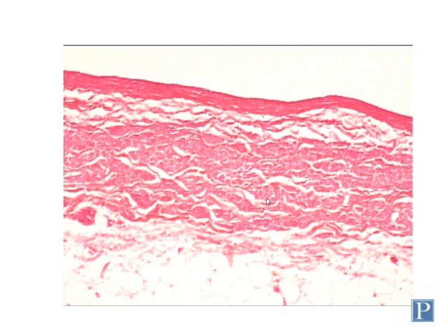Here's the example of a large vein that we're going to look at in lab. This comes from, I believe, the inferior vena cava, and the tunica media in the vena cava, while much thicker than in medium and other smaller veins, is not nearly as large or well developed as in large arteries such as the aorta.